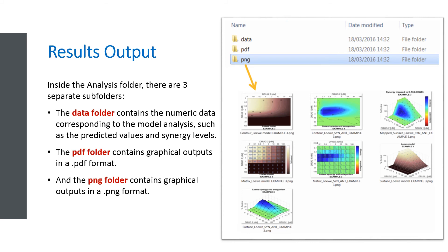Inside each analysis folder, there are three separate subfolders. The Data folder contains the numeric data corresponding to the model analysis, such as the predicted values and Synergy levels. The PDF folder contains graphical outputs in .pdf format, and the PNG folder contains graphical outputs in .png format. If the user is interested in displaying further graphical outputs, a new analysis can be run via the Run Analysis button, having pre-selected the additional plots. These graphics will be automatically saved in the appropriate model folders.